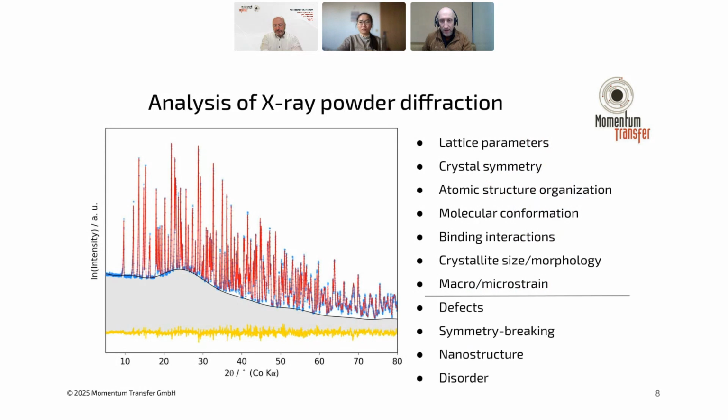and things like that. There are lots of other properties where these things don't come out so clearly in these typical sharp diffraction peaks that you have from X-ray diffraction. And this shows up as diffuse scattering in our signals. And these are properties like defects, like distortions, nanostructure, and amorphous phases. And with standard analysis, that being typically Rietveld refinement, these things are difficult to access, and we're typically throwing out some of the information that contains those details. And so we want to explore that.